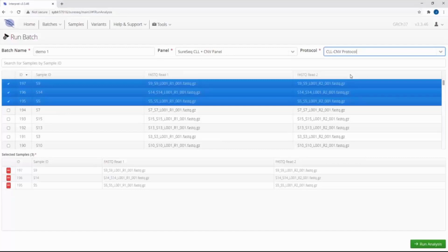So these parameters will be which type of variants we want to identify, what parameters to use, depending on which parameters we are looking for, and finally which type of cutoffs to use. And then once the results have been obtained, which filtering should be applied to the end results. Once these three options have been put in place, we would just be clicking down here at the right hand side and running an analysis.